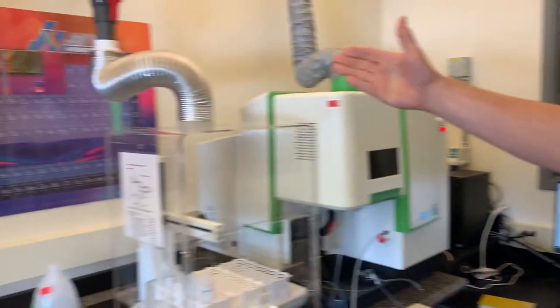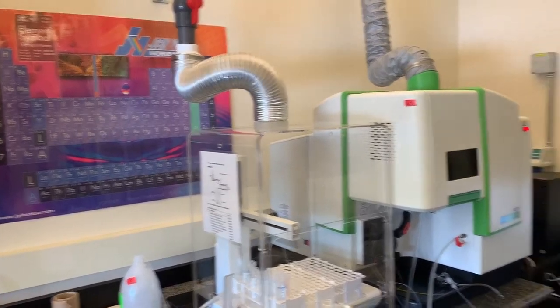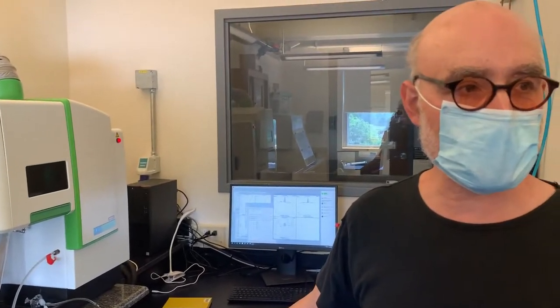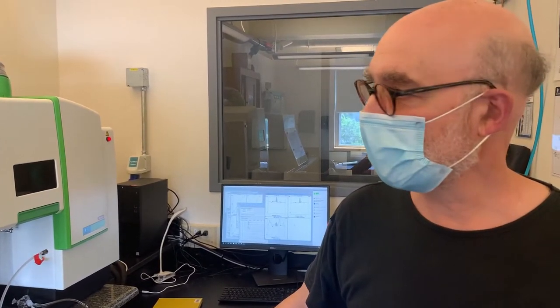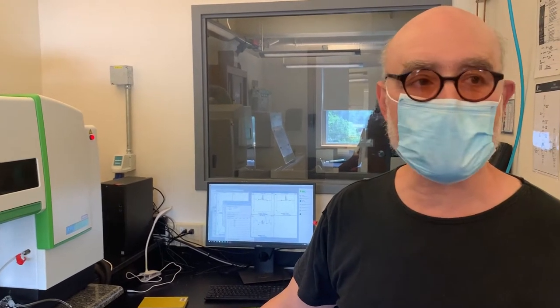These machines are used in geology for two things. They're used to understand the concentration of elements in water. And they can do much, but not all, of the periodic table. So now we have the periodic table there. And it's very useful for looking at what's groundwater, surface water, drinking water. The beauty of ICPs is that many of them can make multiple element analyses on a single sample relatively quickly. So they're very useful for screening water samples.